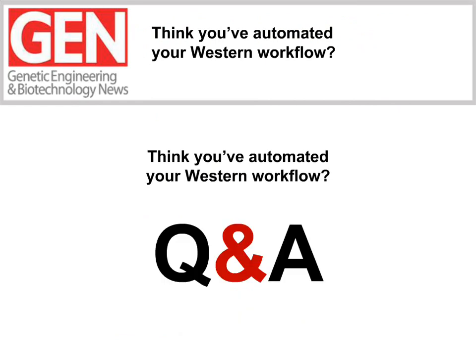We have a lot of really good questions, and we'll answer as many as we can. Andrea, our first question is for you, and we're diving right in. What happens if my target of interest overlaps with your loading control? Do you offer loading controls of different sizes to avoid obfuscation of data?